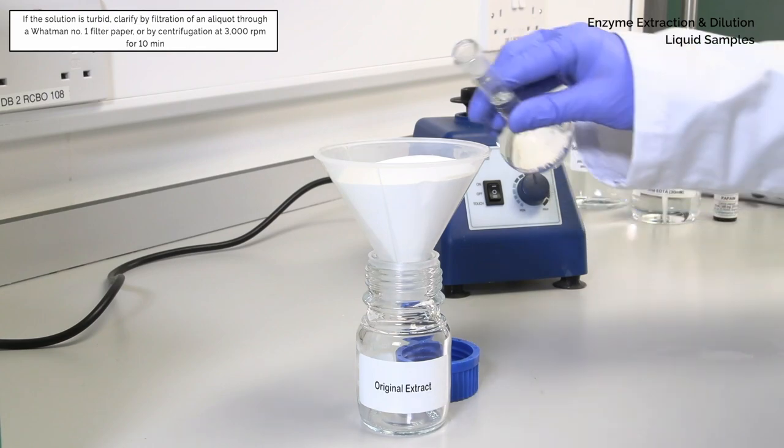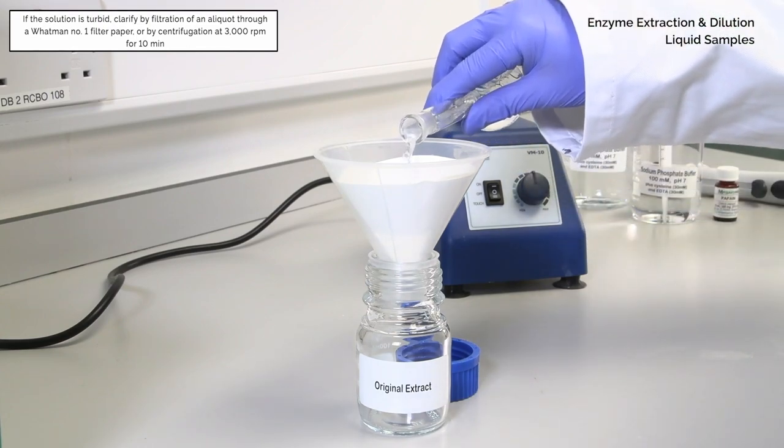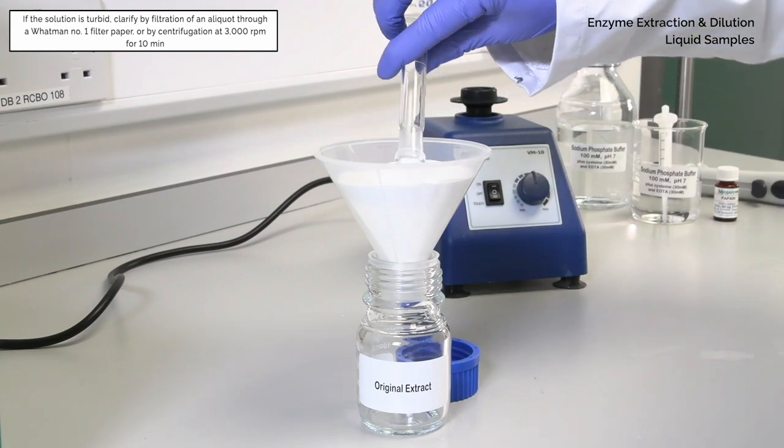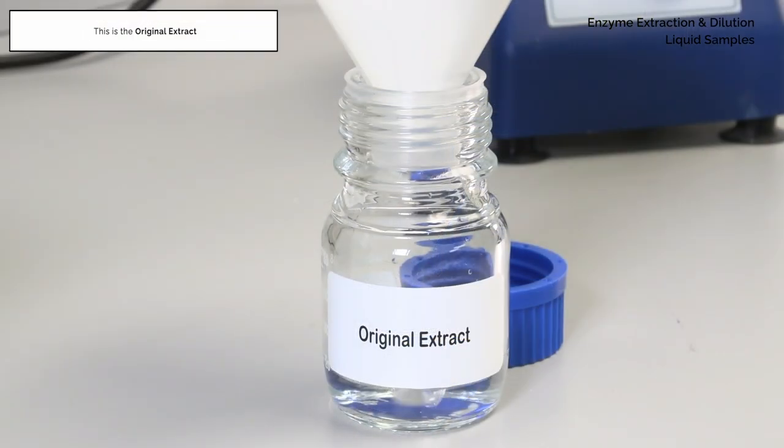If the solution is turbid, clarify by filtering an aliquot through Whatman No. 1 filter paper or by centrifugation at 3000 rpm for 10 minutes. This is the original extract.